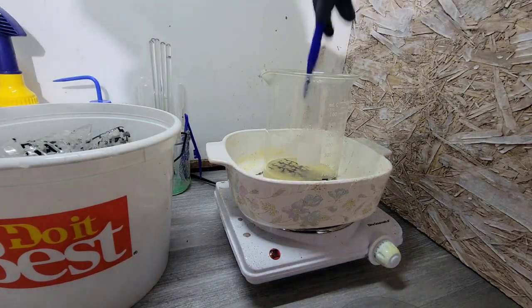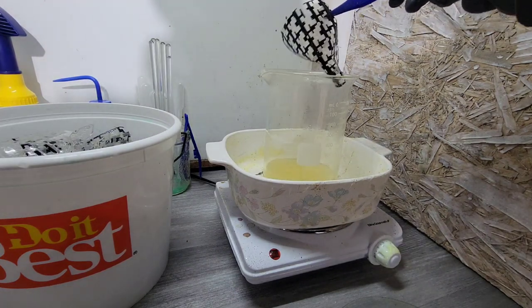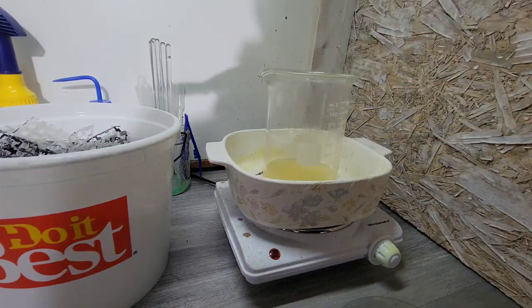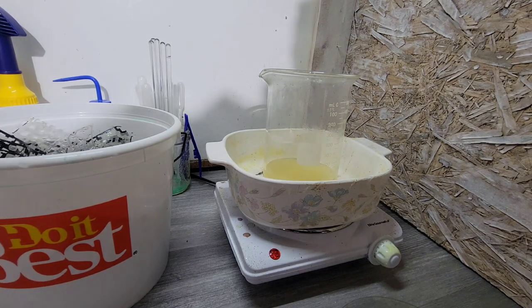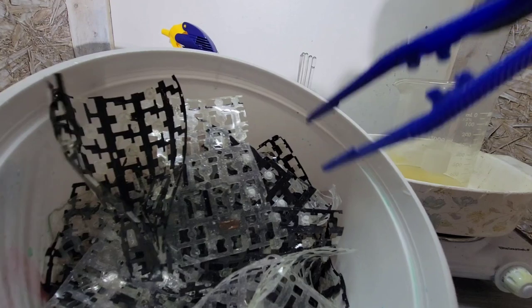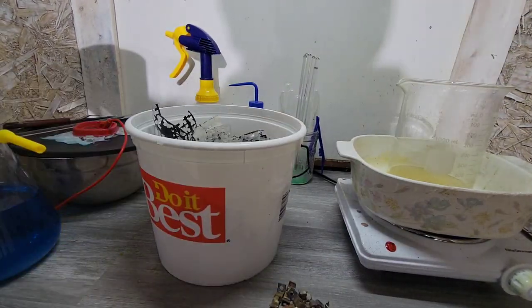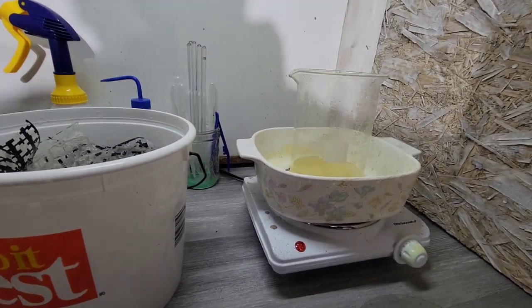So I'm going to give this a rinse with some tap water. I'm probably going to dunk them individually in tap water so that the silver chloride kind of falls off of them into the water. I feel like if I just fill that up, it's going to be a pain in the rear to get all the silver chloride to the bottom.